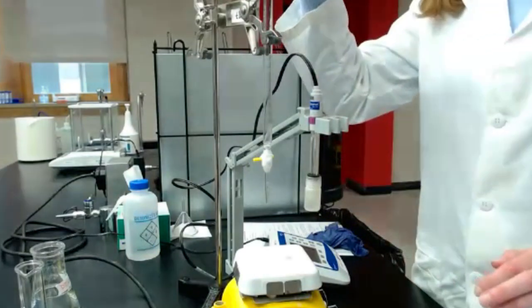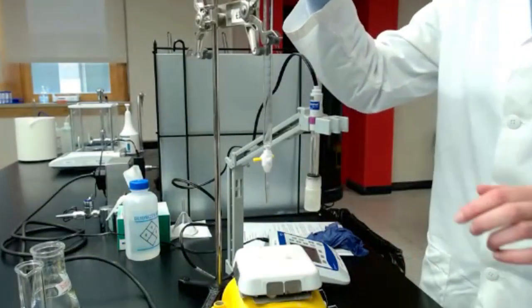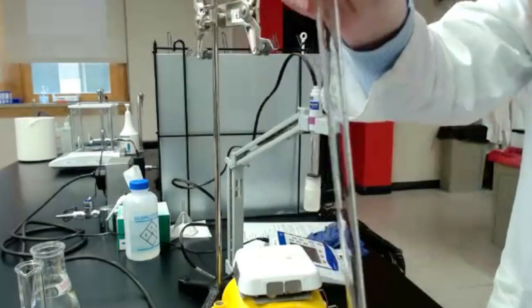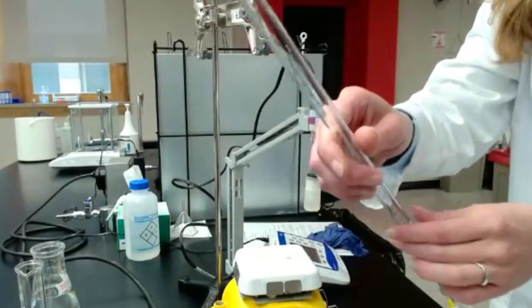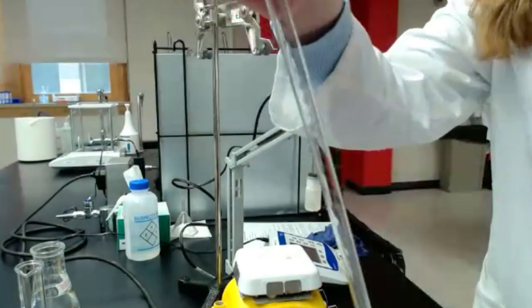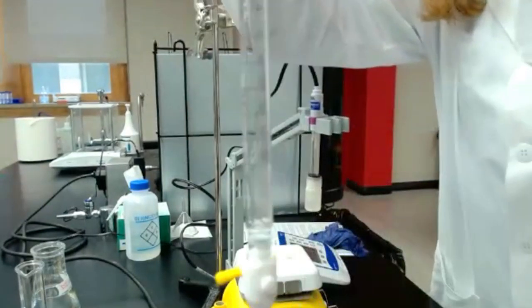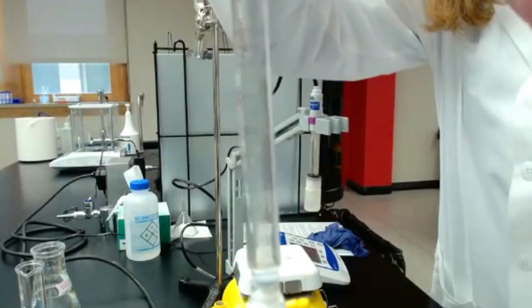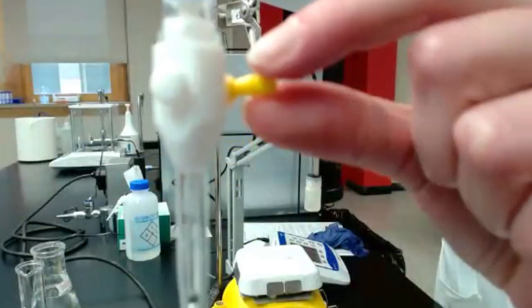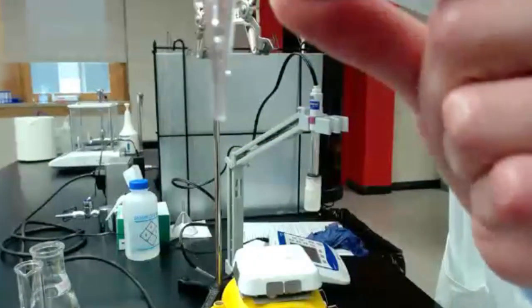So we have first a burette. I'm just gonna show you the burette. Here I have a burette of 50 milliliters. The burette is that cylinder that has some graduation on it, with a tap and with the tip.